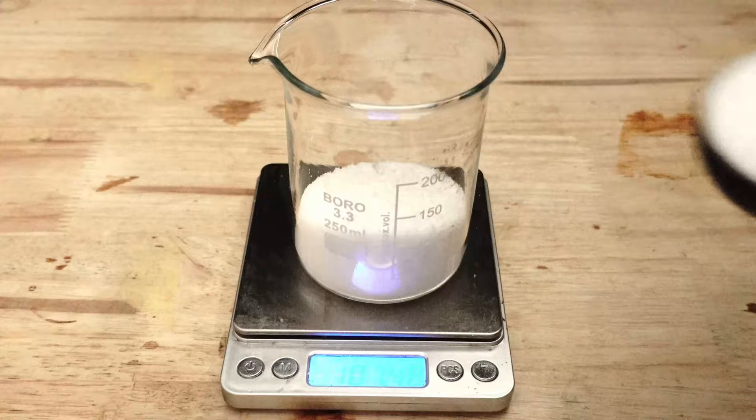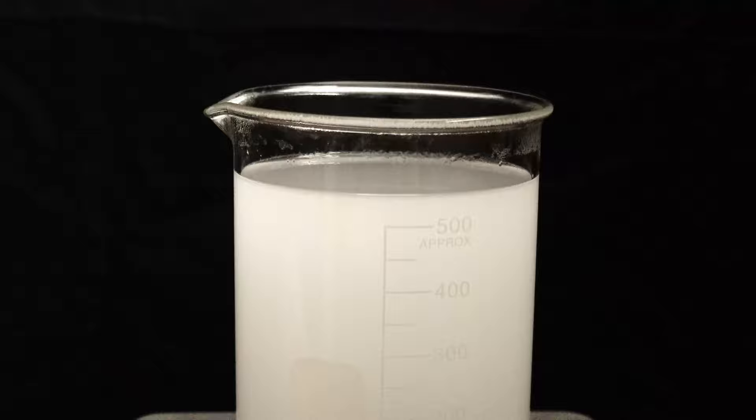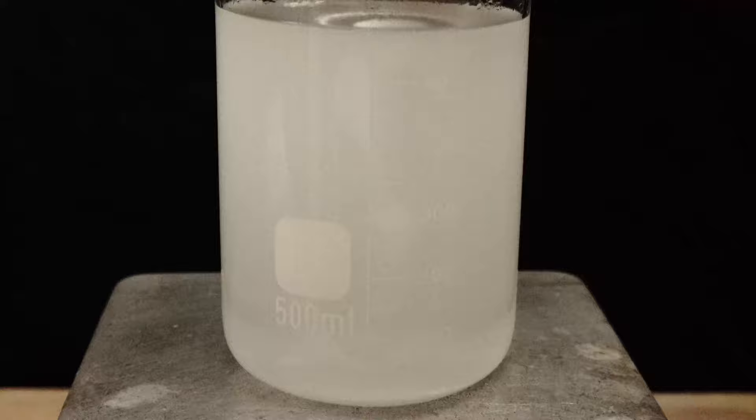We start off by weighing 180 grams of sodium hydroxide drain cleaner and add this to 500 milliliters of distilled water. I then add a stir bar and stir everything until the solution becomes crystal clear.